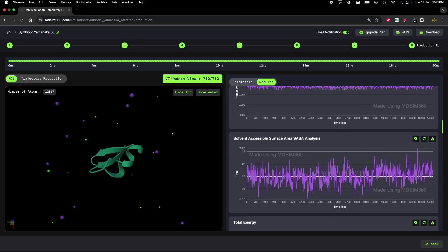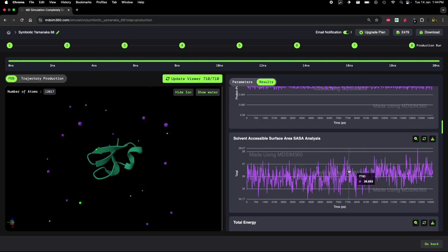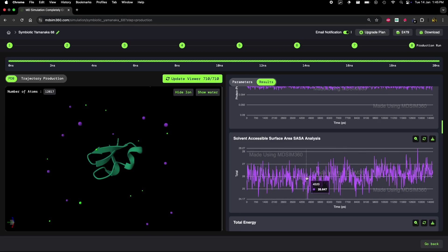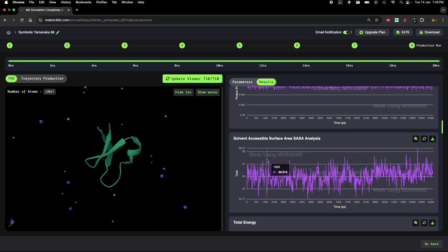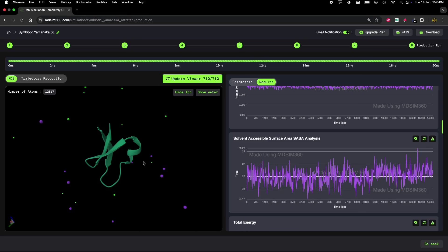Finally, we have the Solvent Accessible Surface Area analysis. SASA tells us how much of the protein's surface is exposed to the solvent. If the protein is stable and folded tightly, we'd expect a smaller SASA. However, as the protein begins to unfold, more of its surface area becomes accessible to the solvent. In this simulation, we see a small increase in SASA, suggesting that the protein is starting to unfold and exposing more of its surface to the surrounding solvent molecules.